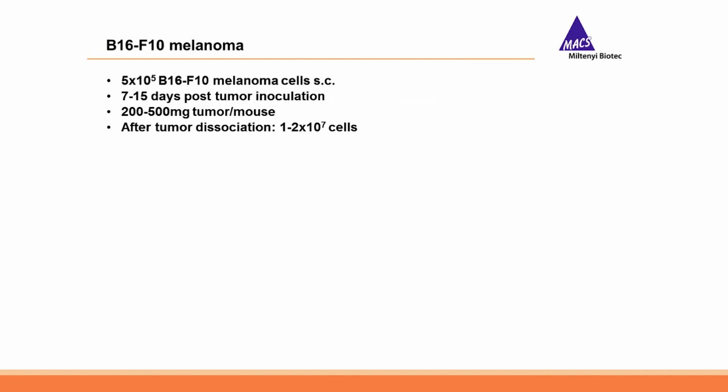However, let's briefly touch on this. And I would say the most frequent basic question is, why should I isolate my TILs? Because I just want to do flow analysis, so I can just gate on them based on CD45, and then it's fine. Okay, let's just do a calculation based on a real-life example.